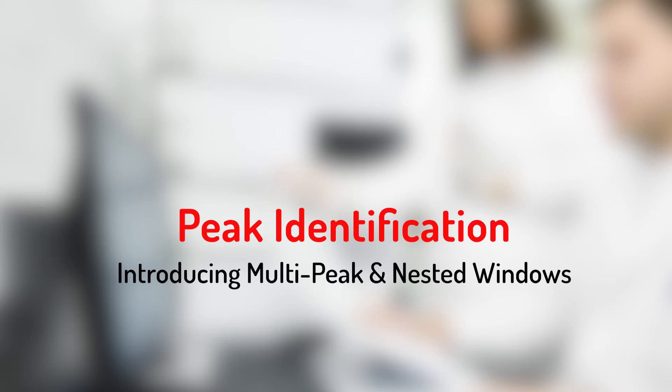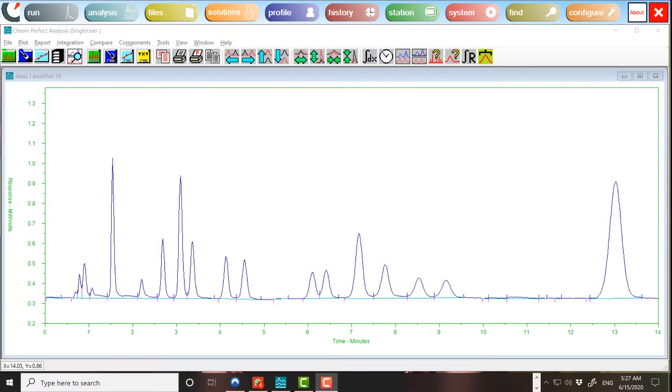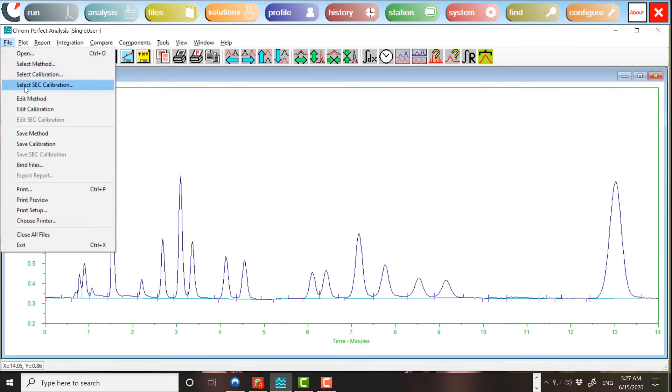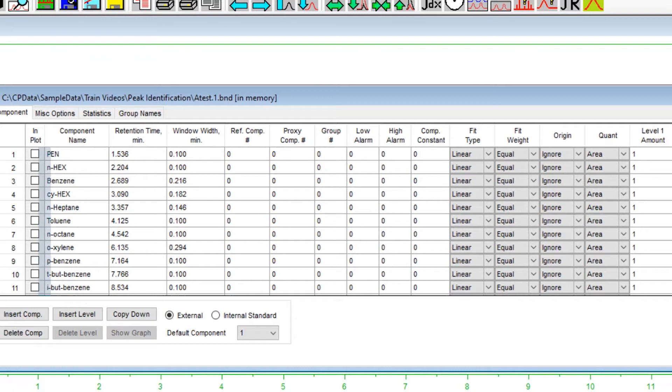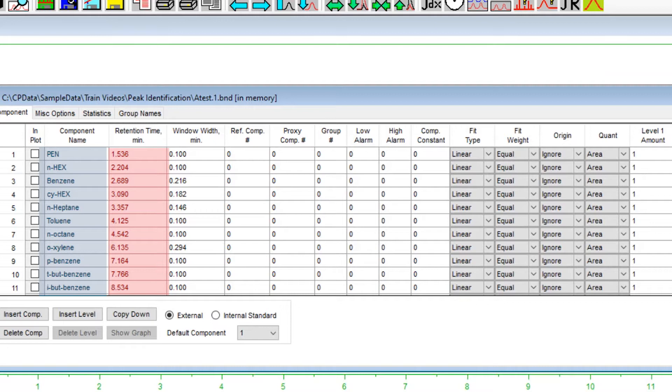Peak Identification. The process of peak identification is straightforward. The governing calibration file contains a list of components, each of which has a specified expected retention time and a specified window width.